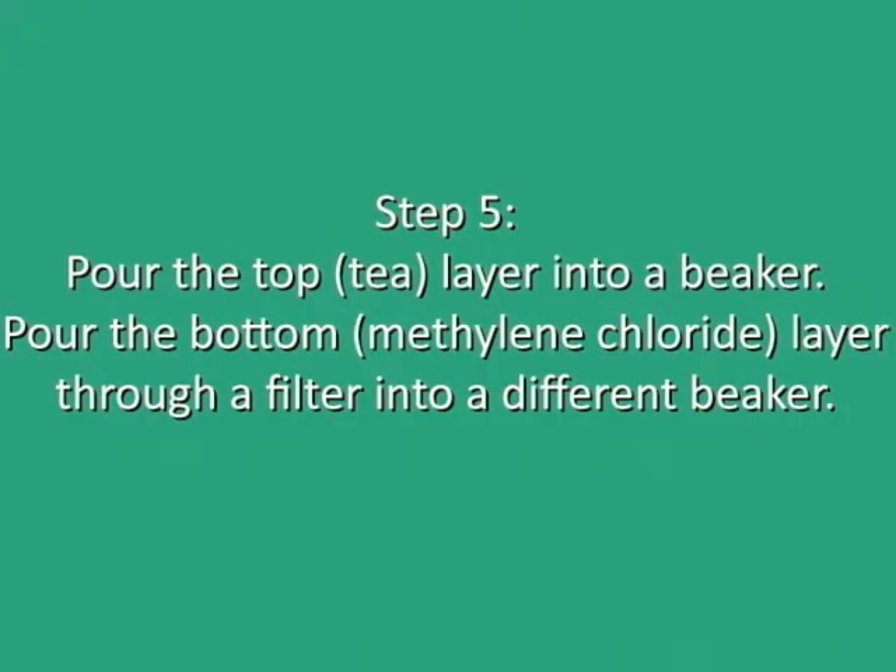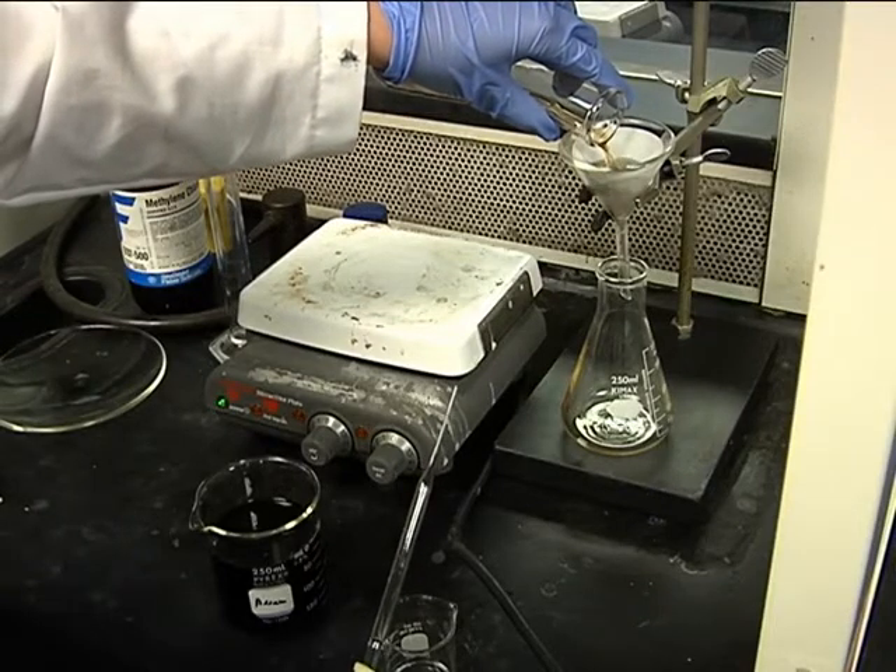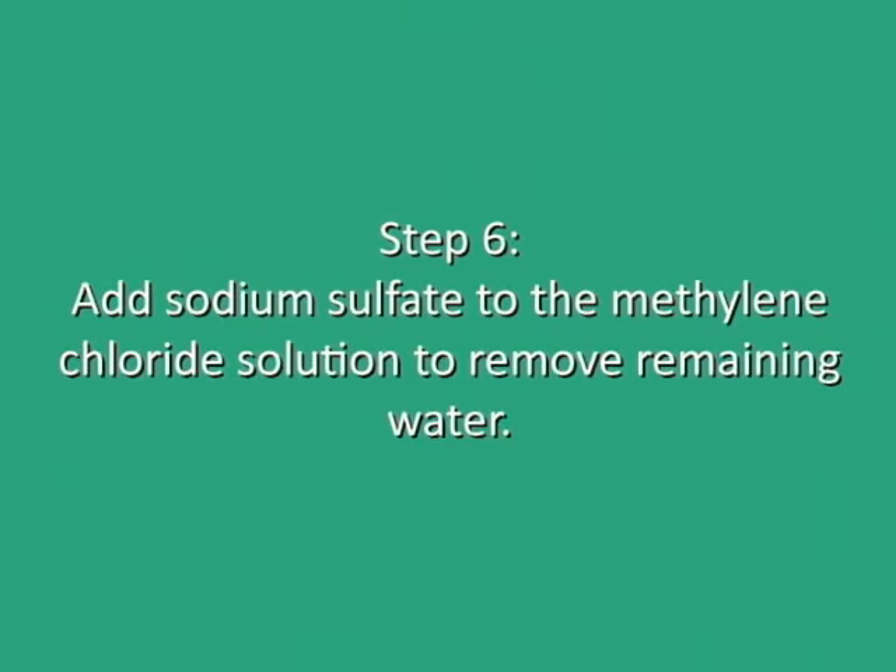We pour as much of the upper layer as possible into a beaker and discard it. Then we pour the rest of the mixture through a filter that only lets water through. Now we just have the caffeine remaining in the methylene chloride.